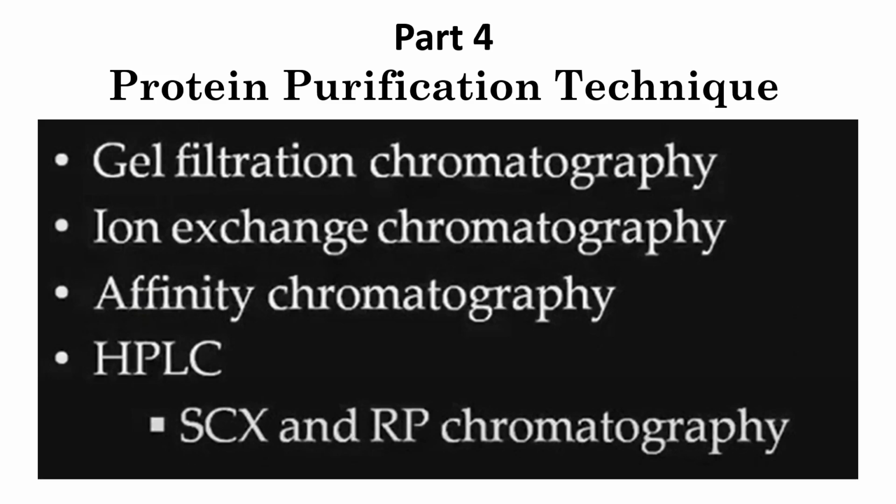Similarly, in terms of ion exchange chromatography, depending upon the charge, the beads are either positively charged or negatively charged, depending upon what kind of protein you want to purify. If they are positively charged, then the negatively charged proteins initially bind to those beads. Then all the positively charged will wash away. Only negatively charged proteins will be present on the bead. Then you can elute them and collect the protein. That's how ion exchange works.